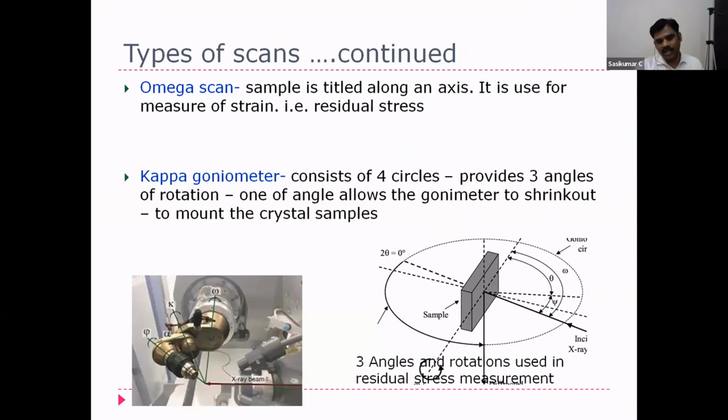So this is required if you are analyzing your specimen for orientation. Sometimes you are making a silicon epitaxial film, and you want to know whether your film and the base material are properly aligned in the same direction, or have different directions. Or you are making a material with a single orientation, a single crystal, or a polycrystal oriented in a single direction. If you are making materials having different orientations, then for such orientation studies this kind of tool will be efficient and effective for you.